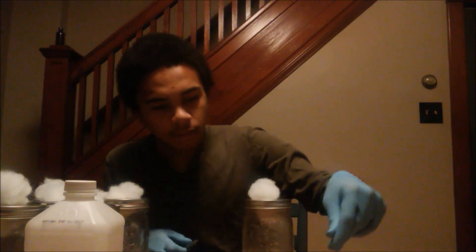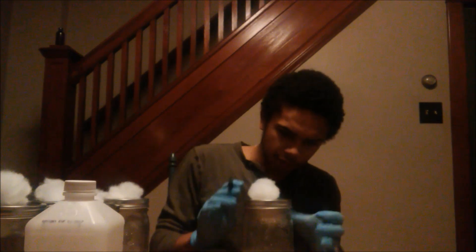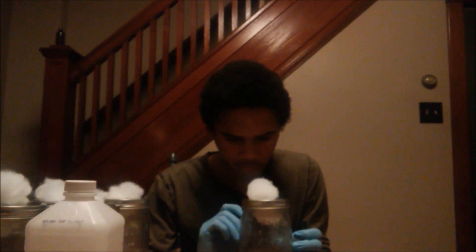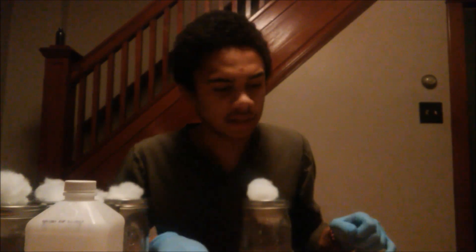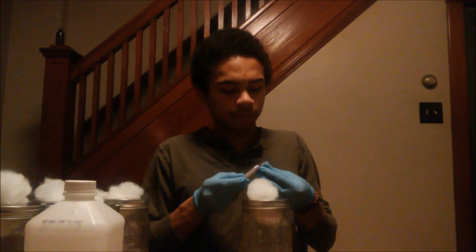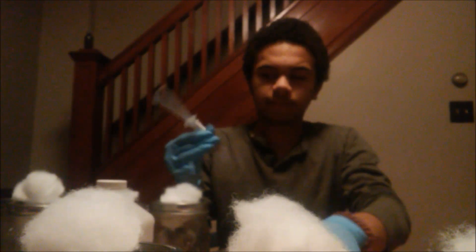You're going to need some way to mark each jar so you don't get them mixed up because the mycelium pretty much looks the same. So the first one we're going to be doing is the reishi. I also recommend keeping a journal of the dates and times and all that good stuff just to keep track of growth patterns. Don't forget to shake the liquid culture before you inject.